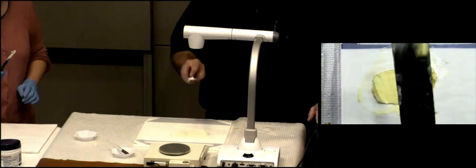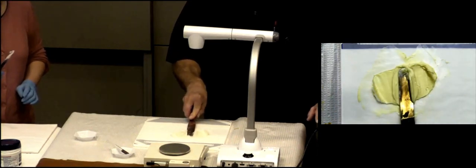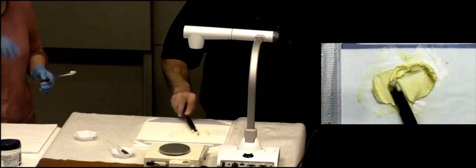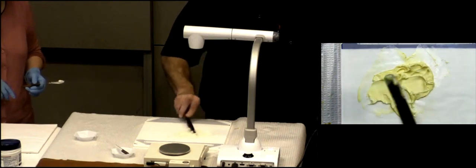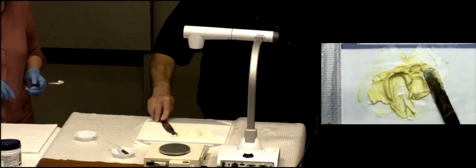Watch this. It's not magic. Don't start from up here. Just go right over and watch. What am I doing? See the bend in the spatula? The official term is squishing. You're going to squish down really firmly and then do a little circle. So gather the stuff over. When you see a little spot, something that needs to be broken up, you squish it down firmly and rub it. Some of you just kind of push it around. You need to make sure you squish down hard and rub out any sort of chunks.